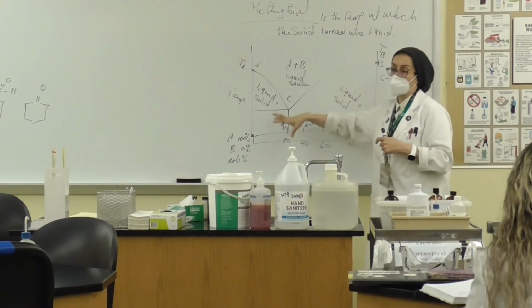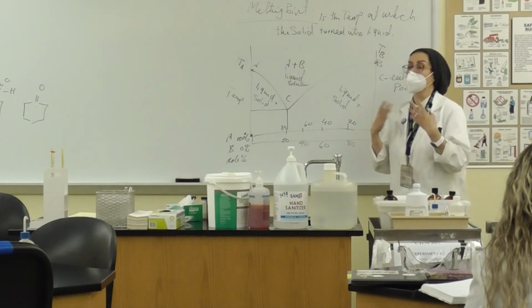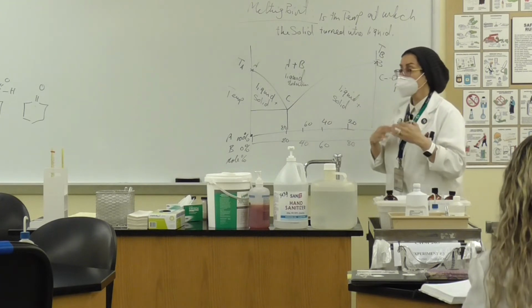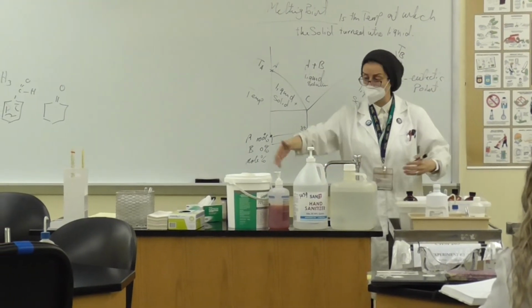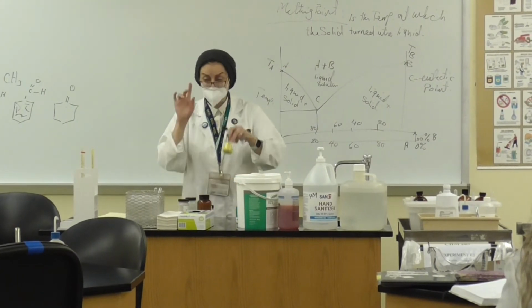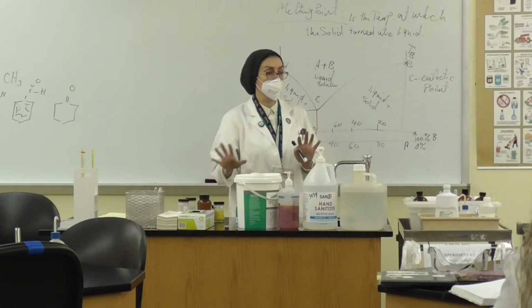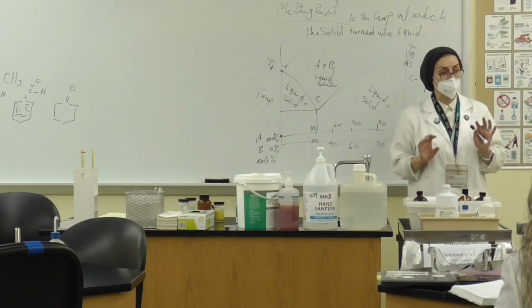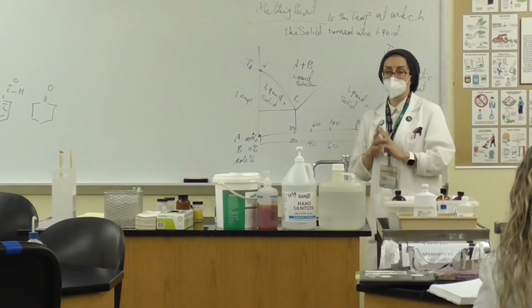This is again the diagram when we're going to have a mixture. Because now we're going to have an unknown that has a mixture with more than one compound. Usually the technique is like that. Whatever we have, like for instance, we have a list of these chemicals, all right? We're going to take each one of them by itself, okay? Pure, or considerably pure, and we're going to measure the melting point of that solid, okay? We know what it is, because it's labeled and it has the CAS number and everything.